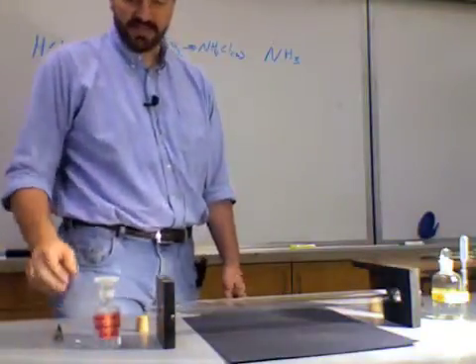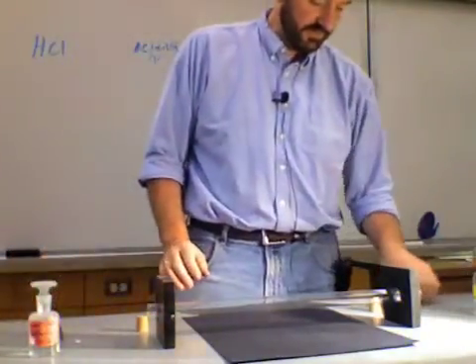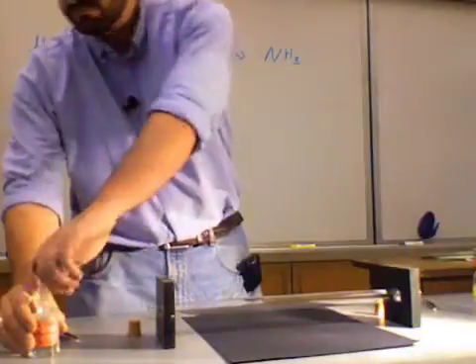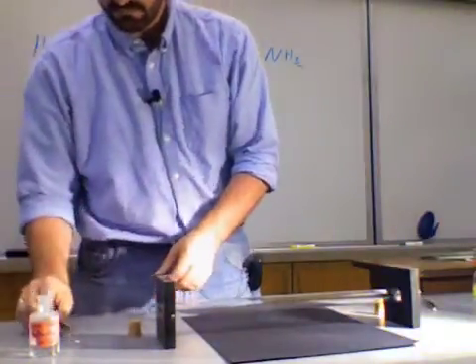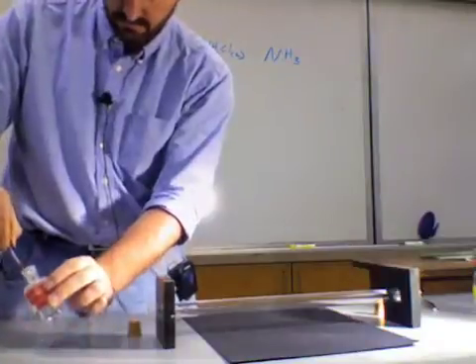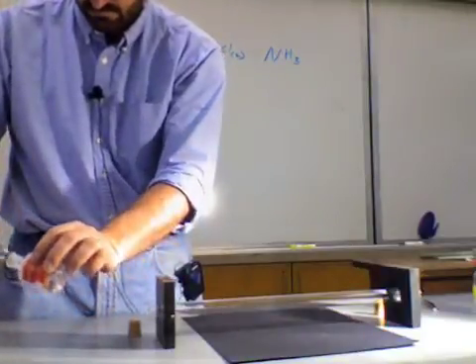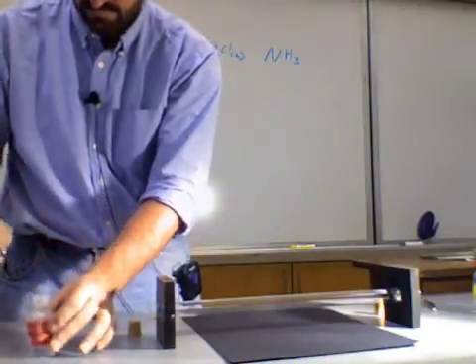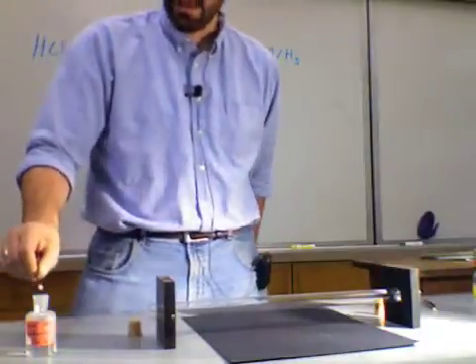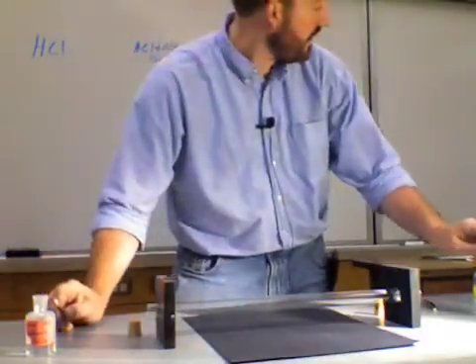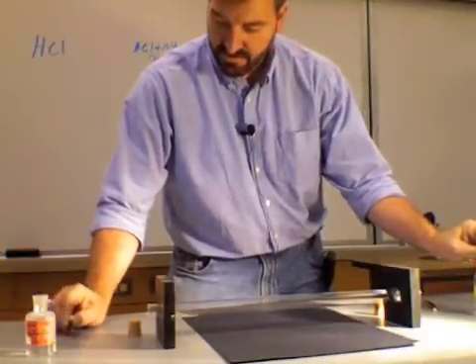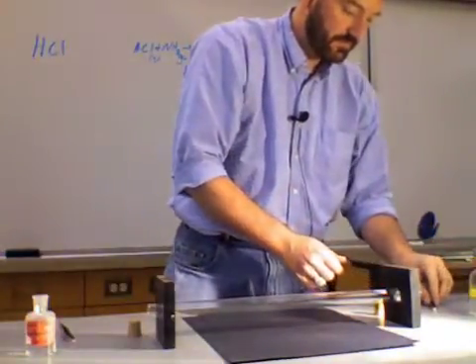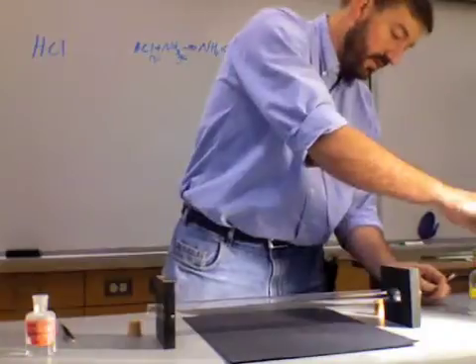So let's go ahead and do this. So I got my two tweezers. I got my stoppers. We're about ready to go. I have my drop of hydrochloric acid, my hydrochloric acid impregnated. I drop her over here. Of course, this top is stuck. There we go. I have my ammonia on this side.